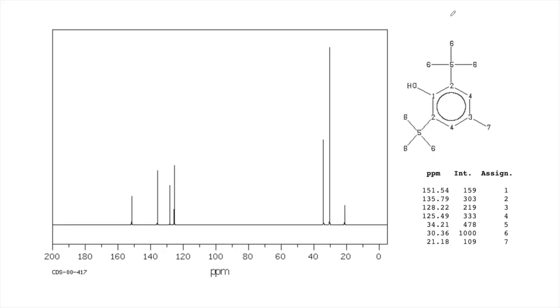Here's what the C13 spectrum for BHT looks like. So you can look at these peaks and you can see that although some are bigger than others, there's not a good quantitative relationship between how tall the peak is and how many carbons are under it. So for instance, these peaks should be exactly the same height, those peaks should be the same height, these peaks should be exactly twice as big as those. This peak should be 3 times as big as that, not 2, etc. So the quantitative relationships for heights don't hold for C13. They will hold for proton NMR, which is going to be the next thing that we talk about.